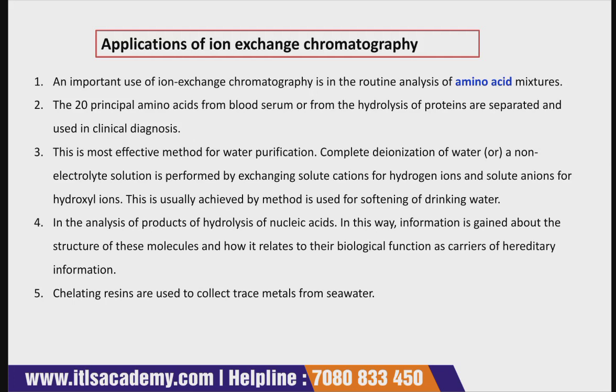This is usually achieved by the method used for softening of drinking water. So if you want the purification of water, ion exchange chromatography is used.